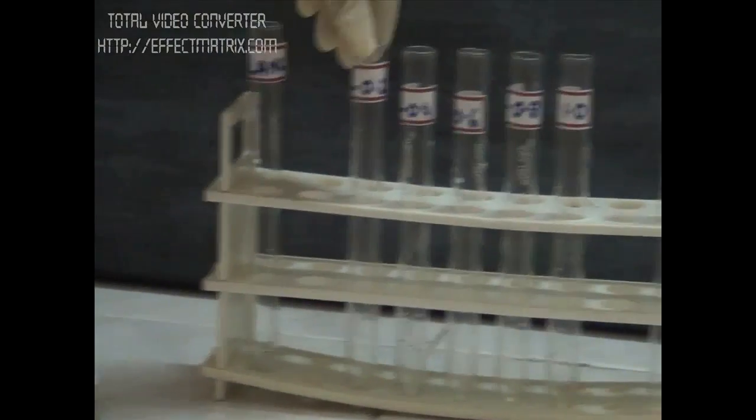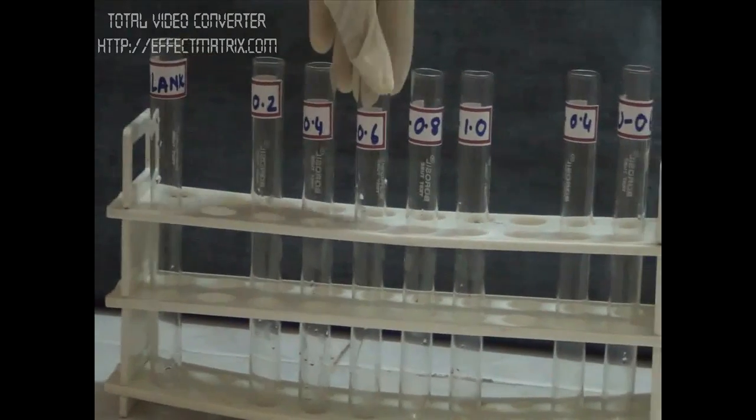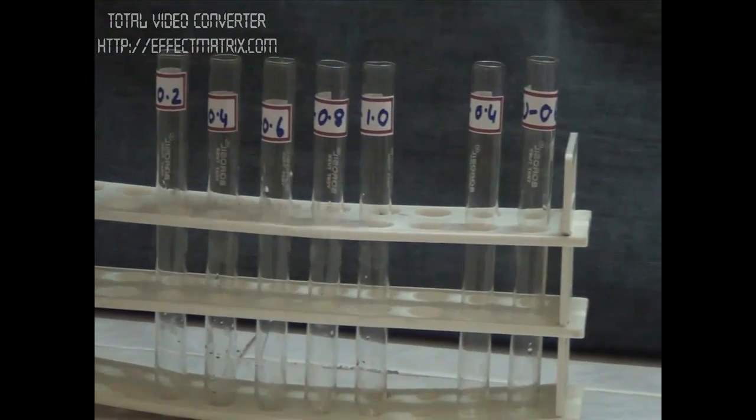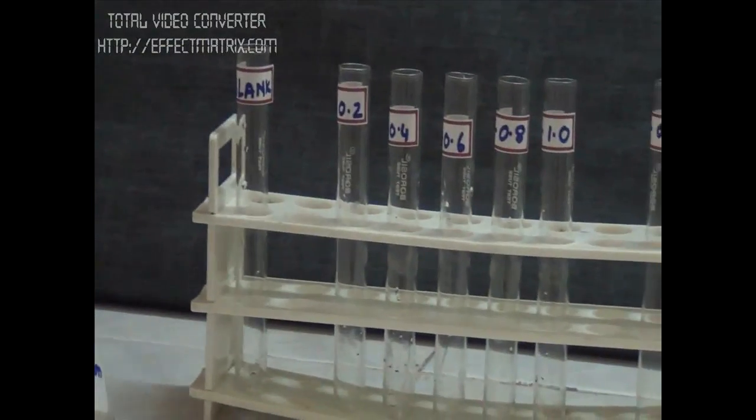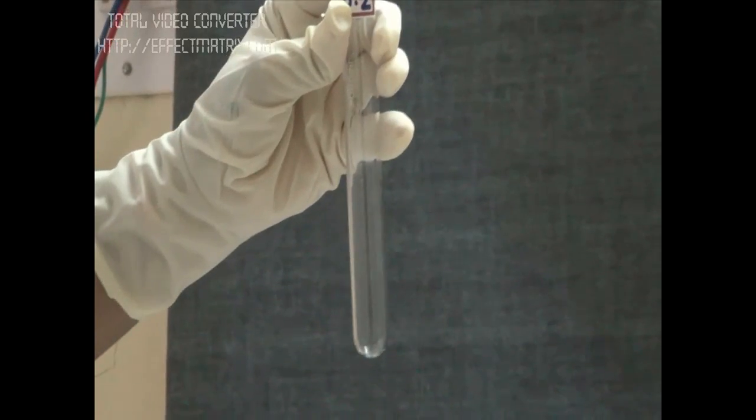We are taking aliquots as 0.2, 0.4, 0.6, 0.8 to 1 ml. In the blank, we don't have to add any RNA. So in the first standard tube, I will take 0.2 ml of the standard RNA solution.